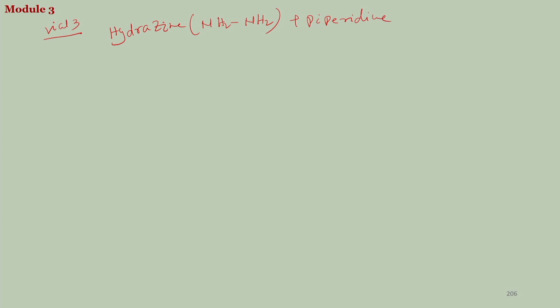So, what this will do is hydrazine will react with the pyrimidine nucleobases. So, it reacts with both thymine and cytosine.